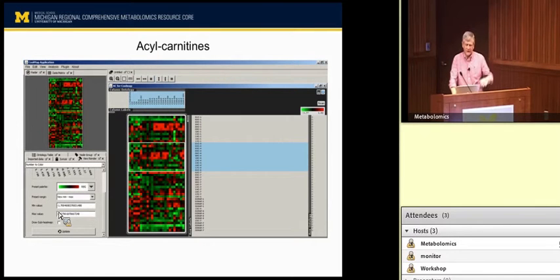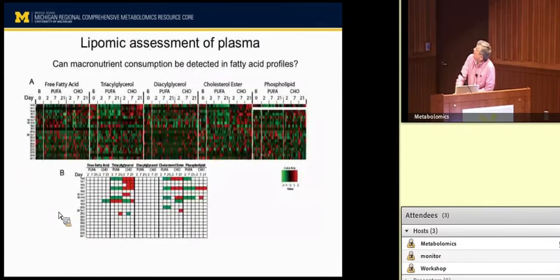People like George can do statistics and think through numbers. I need to see things and look at patterns, and it's been really helpful. You can see down here with the NAFLD people, they really get green when they go into the carbohydrate diet. And I showed you before that the relationships between a lot of things are robustly changed in individuals with fatty liver disease.